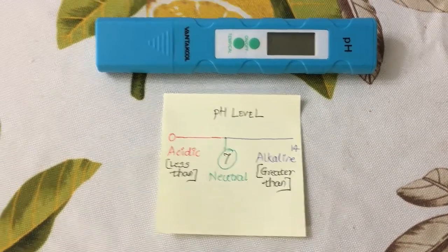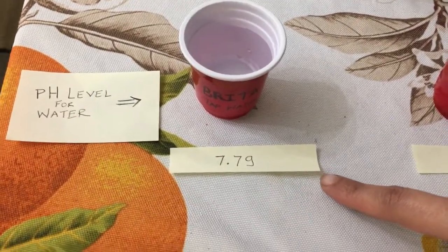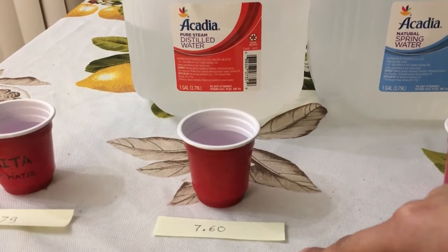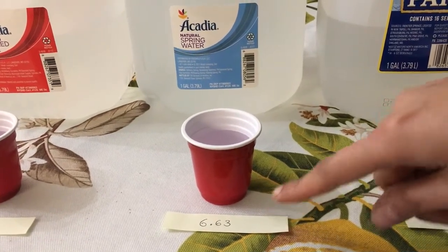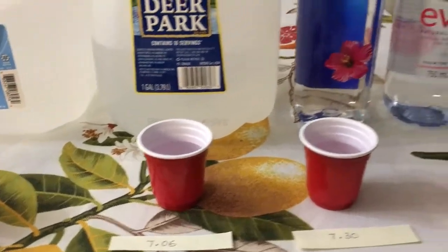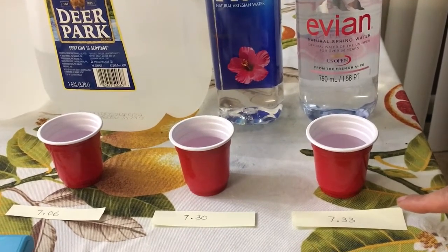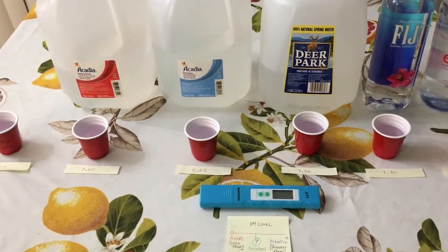Now here are the results: pH level for Brita tap water is 7.79, pH level of Aquacardia distilled water is 7.60, pH level of Aquacardia spring water is 6.63, pH level of Deer Park is 7.06, pH level of Fiji is 7.30, and pH level of Evian is 7.33. That's all we have for this video, thank you.